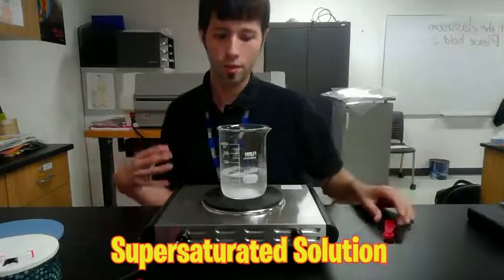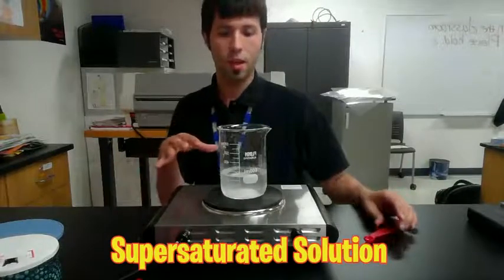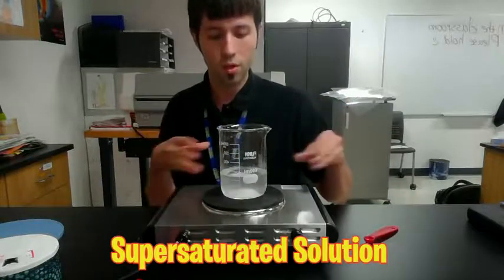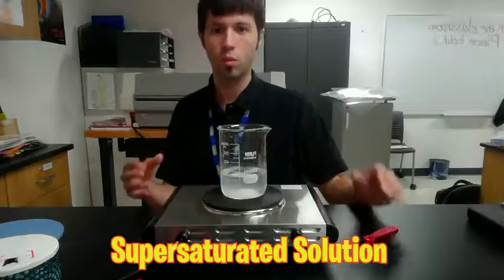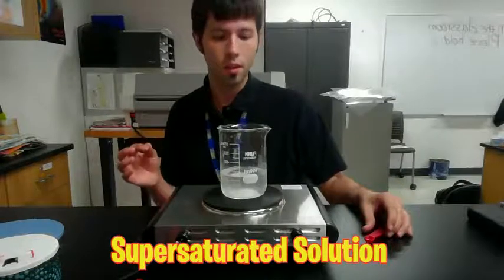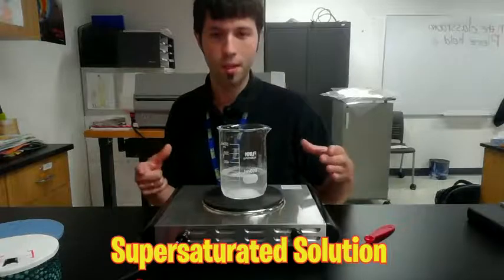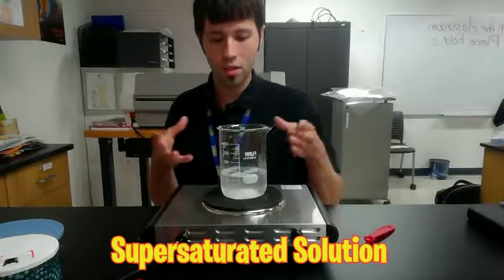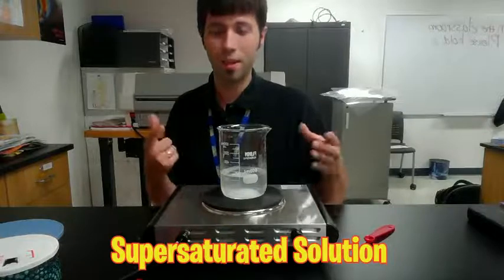All right, so I've had this on the burner for just a little bit, and you can see that the water is starting to clear up, which means that the water is actually taking in more salt. What I'm attempting to make is what's called a supersaturated solution. So if something's supersaturated, that means at normal room temperature, it could not dissolve this much salt, but since it's heating up, it can dissolve more.